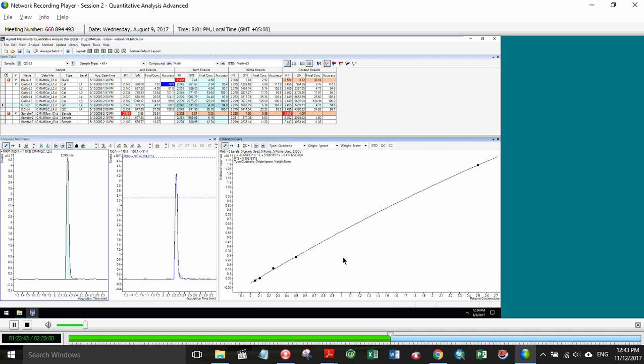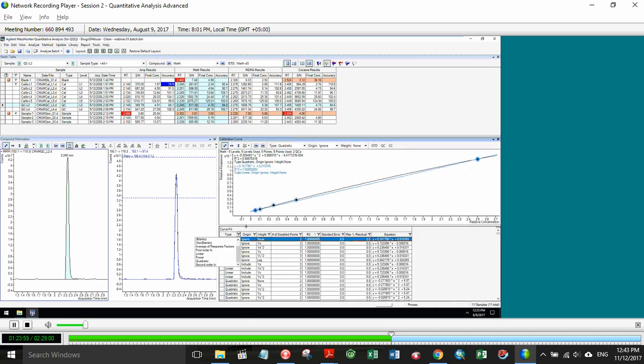When you activate the Curve Fit Assistant, basically what's happening is it gives you all the mathematically valid types of curve fits. You and I, as analytical chemists, will exclude many of those, let's put it that way. However, as Howard's showing us right now, we can look at just certain types of curve fits to narrow that window down. Say I want to stay with a linear curve fit. Here are all my linear curve fits that fit the data set.